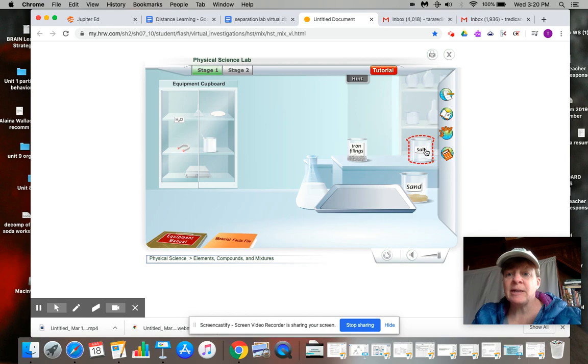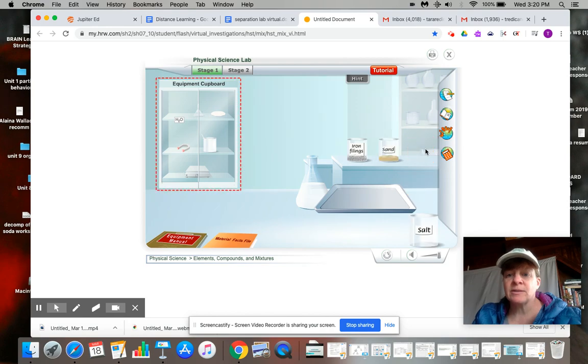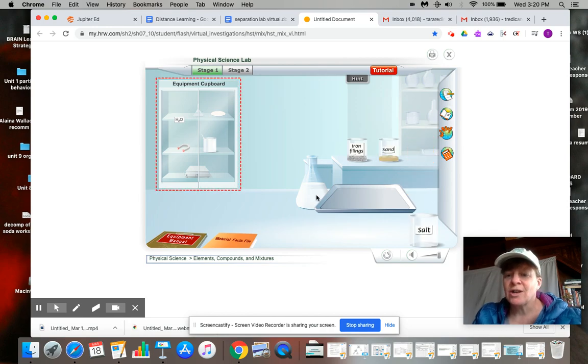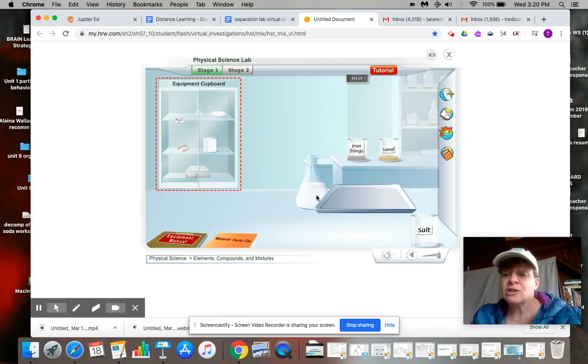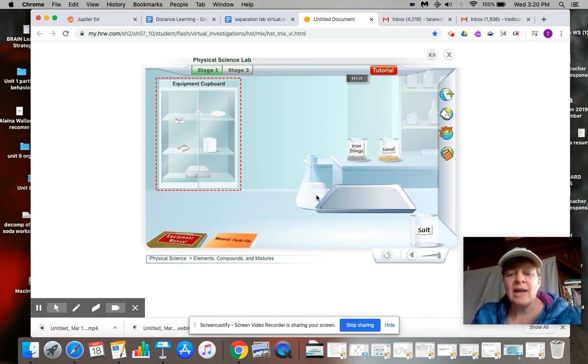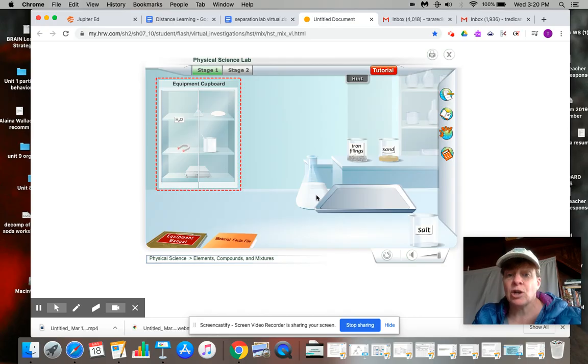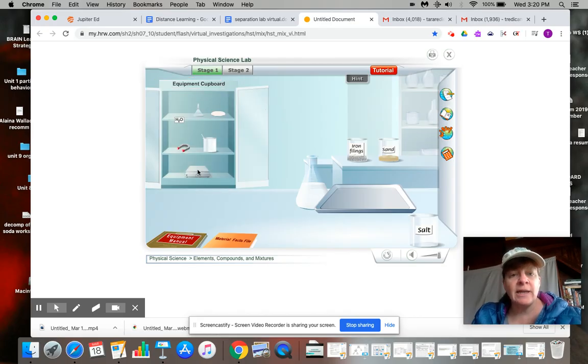And last but not least, we have salt. But we have salt water. We just want the salt. And if you watched the video the other day about the salt fields and how they get the sea salt, they can heat it.